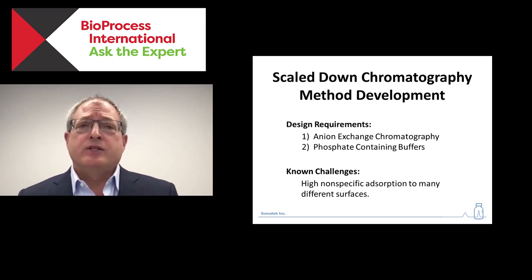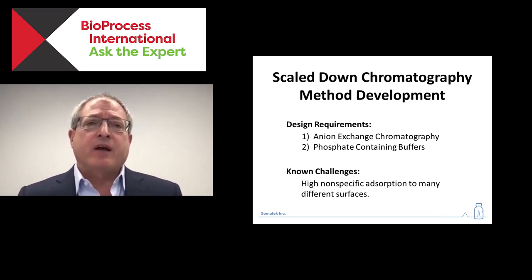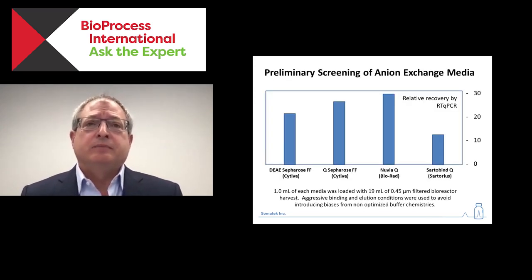And then known challenges, we were routinely seeing a lot of non-specific adsorption to different surfaces. We knew this before we started the process. So mindful of that, that informed some of our initial screening studies.